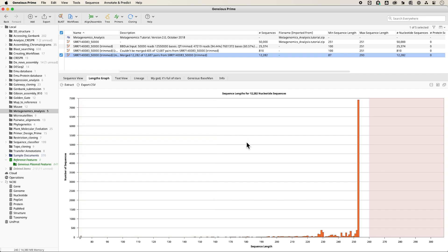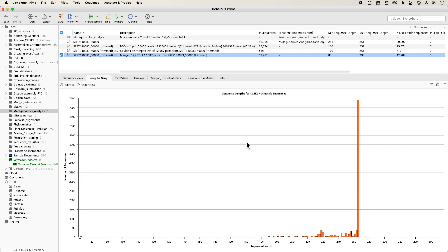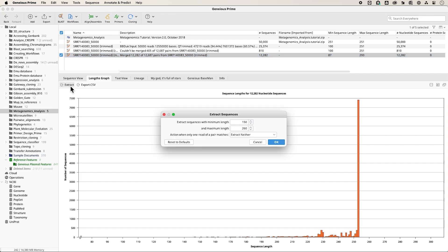The longer sequences may either be contaminated or incorrectly merged sequences. At the same time, the very short sequences do not contain enough sequence to be correctly classified. To ensure you're working with the most relevant data, you can extract only the reads you want to keep.